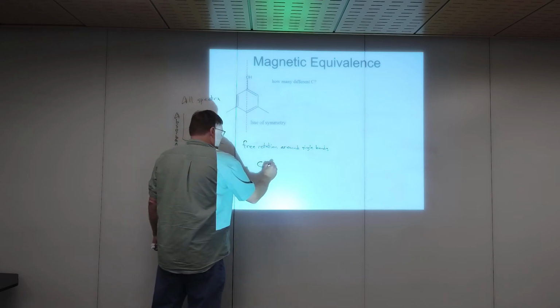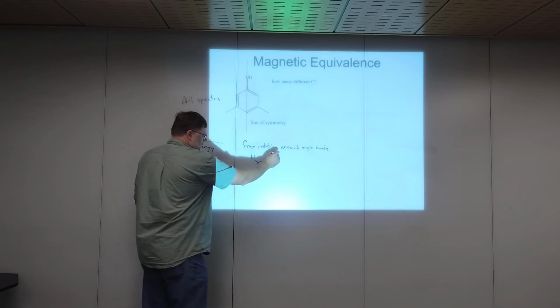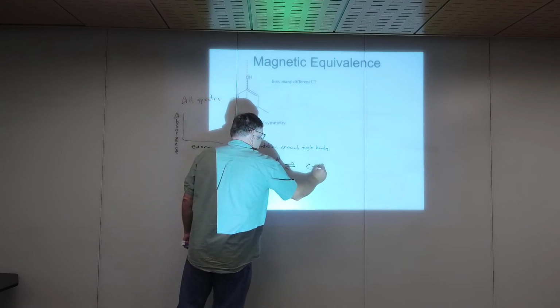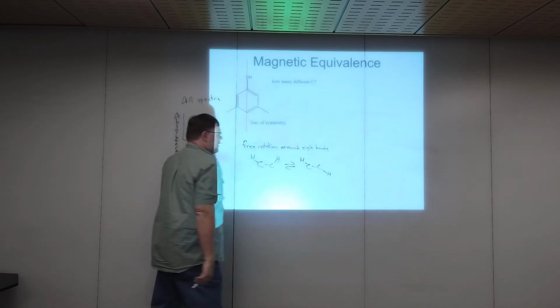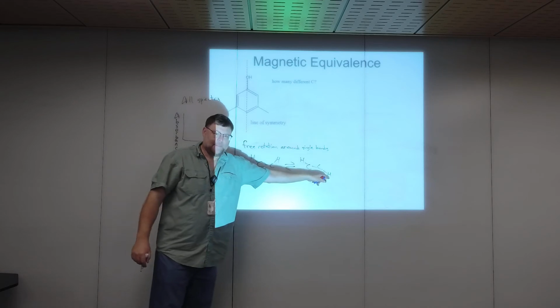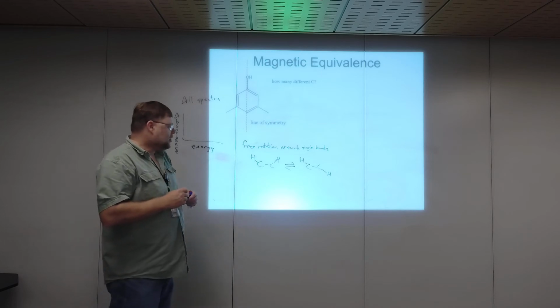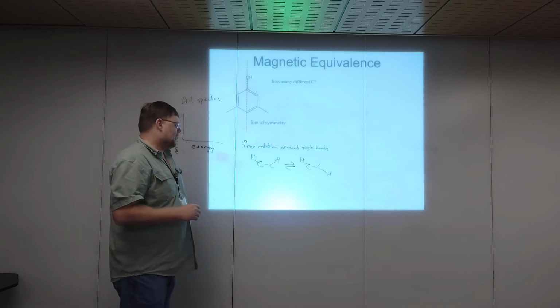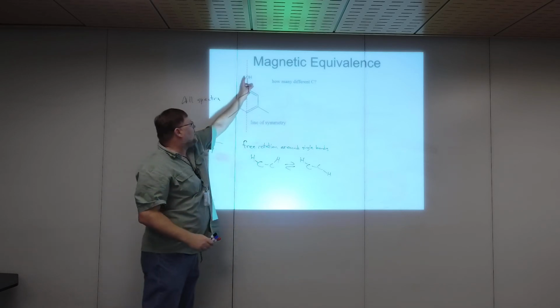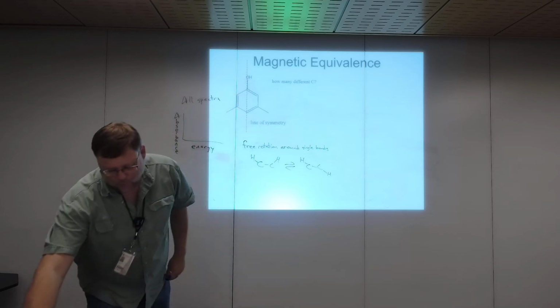Right? So if I've got something that looks like this, right now these four are all in the plane. That's a single bond, so it can rotate. This can go back and forth like that, right? So this H can be on the same side as this H, or it can be opposite. And that can just go round and round. Single bonds, in fact, in molecules spin wildly, hundreds of billions of times a second. They really spin crazy. So this OH is drawn to the right, but that's a single bond, and so really that OH is defining a cone here. The same thing for these methyls, they spin, so you get the plane of symmetry through the board.